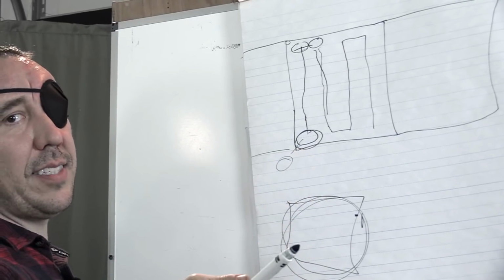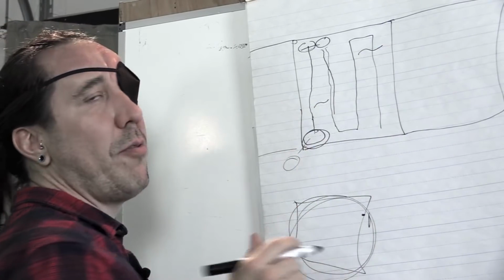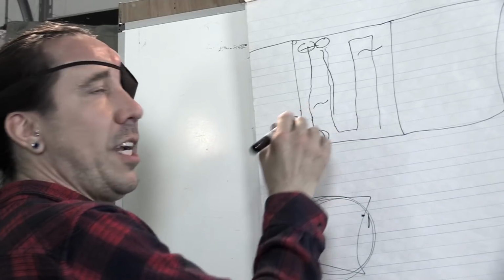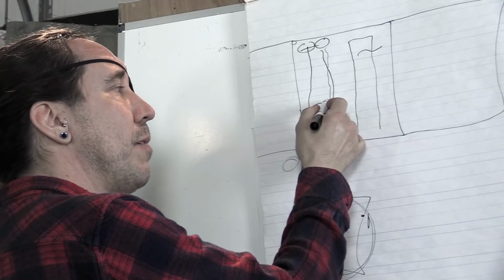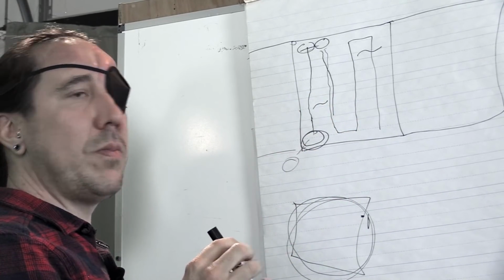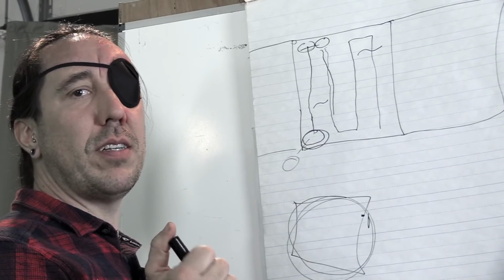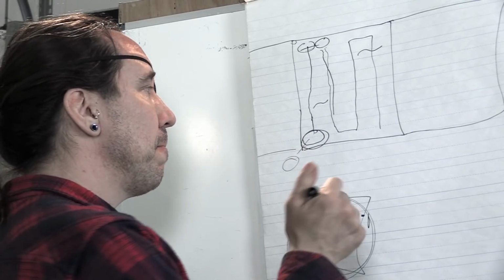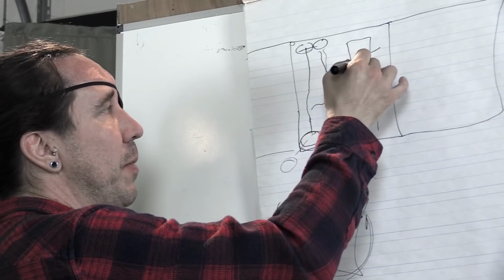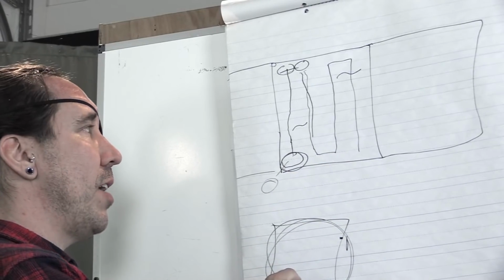Let's say I did see some nematodes. I saw one right here, and I saw one right here. I want to note those in my memory because they're generally going to be moving so much that I'm not going to be able to stop and identify them. I'm going to have to get them to become very slow moving or die, possibly by using a lighter, and we'll show you that in just a minute. So you've seen those 2 nematodes. You want to note that you have 2 nematodes, and then we're going to go on to doing other counts.